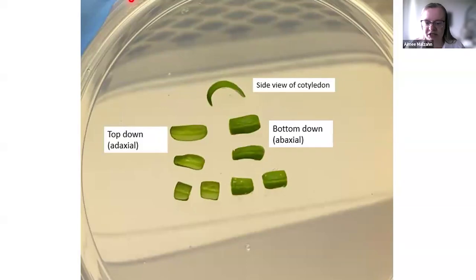And there was a question in the chat about the conditions. I'm not sure, maybe this person could clarify a little bit, but the question was, I believe, to get good explant or good transformation, you need to give the tomato good conditions, right? Can you share and explain the conditions you give to tomatoes, please?